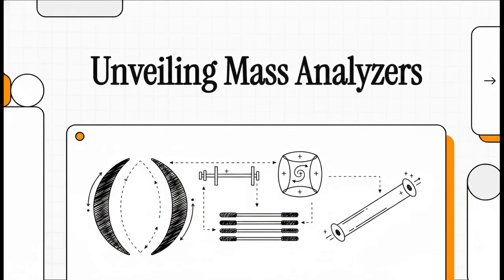Welcome to this explainer. Today, we are cracking open the fascinating black box of mass analyzers. We're going to treat these incredible pieces of scientific equipment exactly like what they are: ingenious, microscopic obstacle courses. We'll be zeroing in on mass analysis, which is the highly specialized tech used to separate ions based entirely on their mass-to-charge ratios. We're going to explore magnetic sectors, double-focusing instruments, linear quadrupoles, quadrupole ion traps, and time-of-flight analyzers.